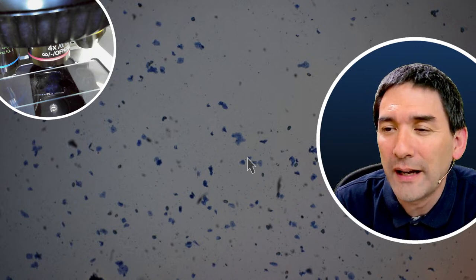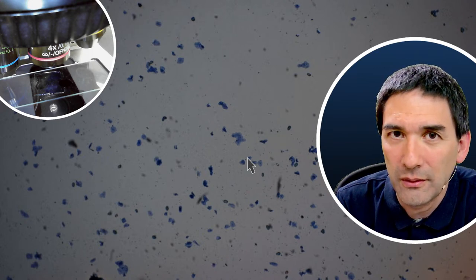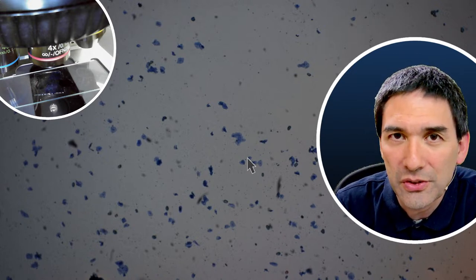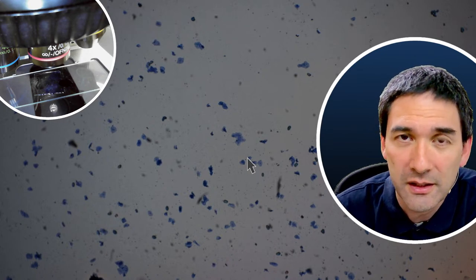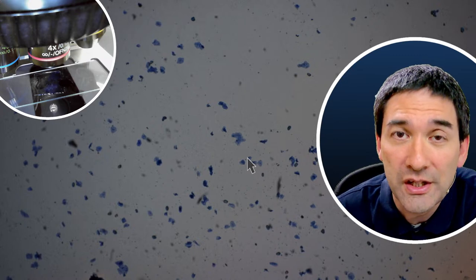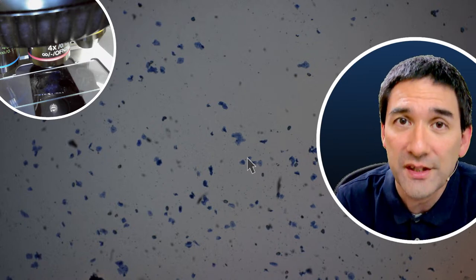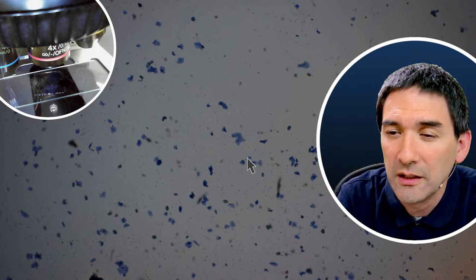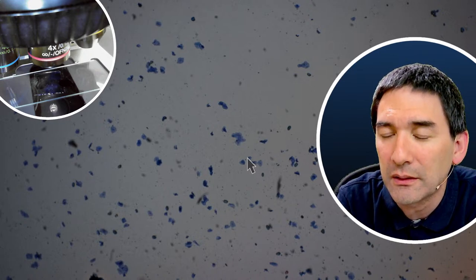Does all milk fat look the same under the microscope? Honestly, yes, because essentially fat looks like fat. You're not able to see the actual molecular structure of the fat. What you're able to see are the fat droplets, and otherwise you're not able to see differences here. Microscopes are not able to resolve the molecular structure, obviously. So the only thing that you're able to see are the fat droplets that you find in the milk.